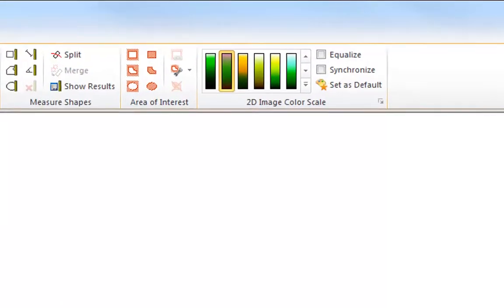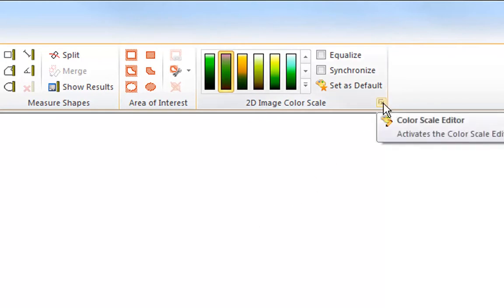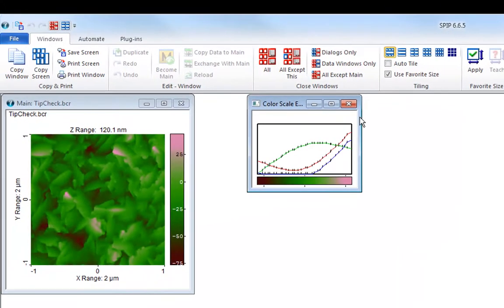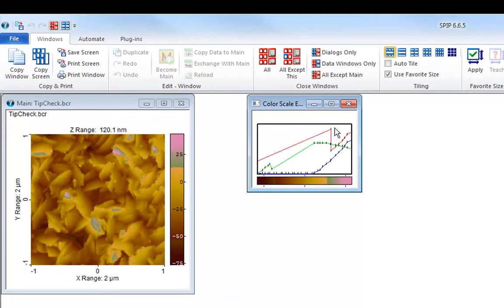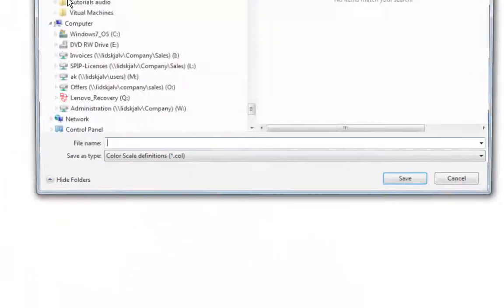Open the color scale editor by clicking the color scale launch button. In the editor you can modify the color scale and create new ones. After editing a color scale save it.